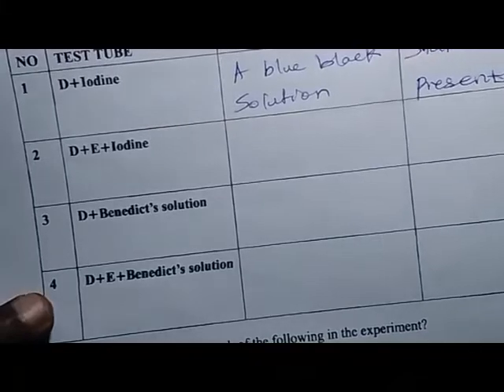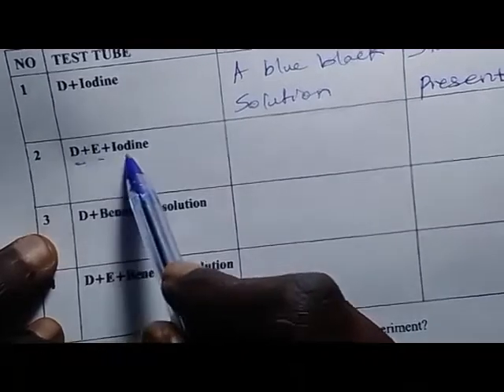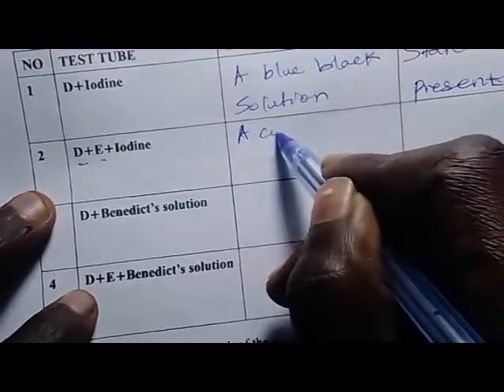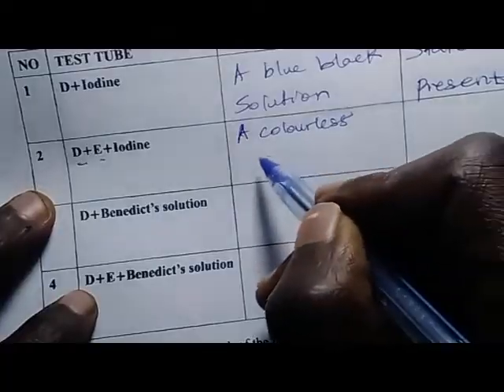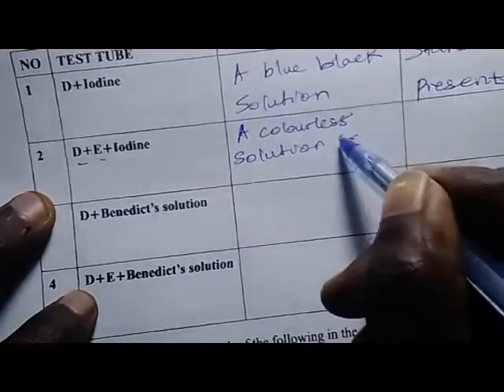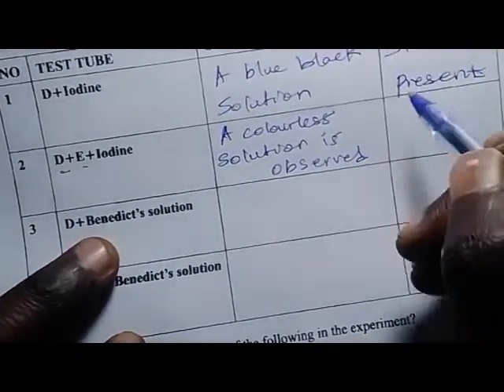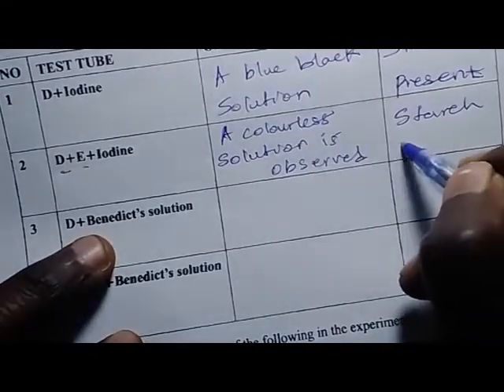As we are told, you put solution D and E and iodine solution. Now your observation should be that a colorless solution is observed. This simply means that the starch was absent.